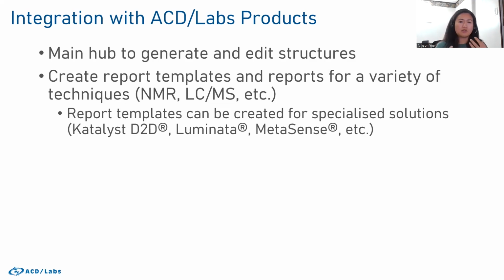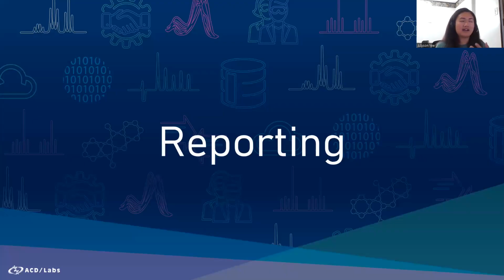And with that being all said, I think that's a great place to segue into the reporting part of this webinar. Reporting may not be something that a lot of people are thinking about in their chemical drawing software packages, and it just may not be mandatory for some people, but being able to build reports or create report templates that look clean and professional can definitely be a big game changer for a lot of people.